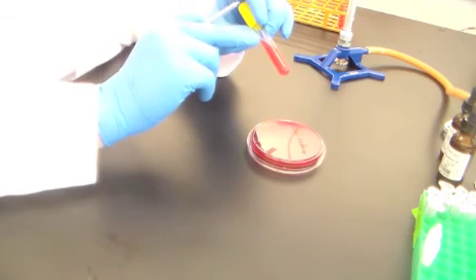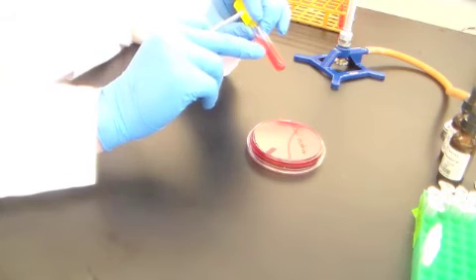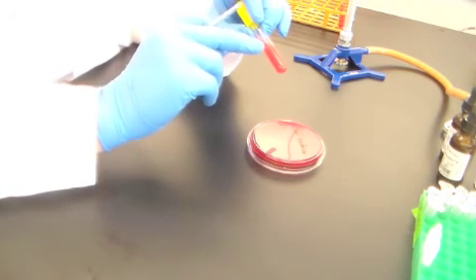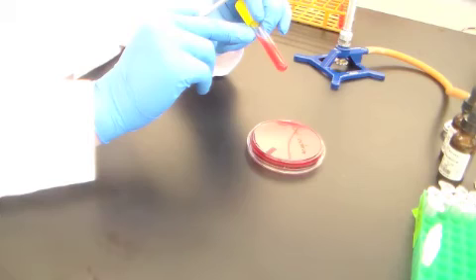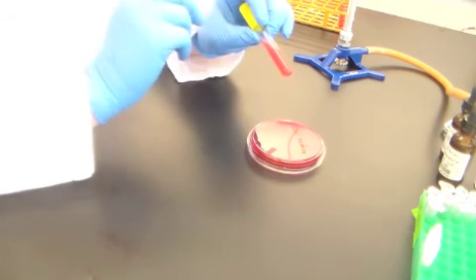So an anaerobic condition is established in the base here, and so bacteria will alter their biochemistry, alter their metabolism under anaerobic conditions, so we can actually assay for multiple biochemical capabilities of bacteria, both aerobically and anaerobically.